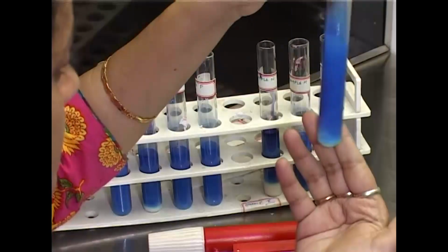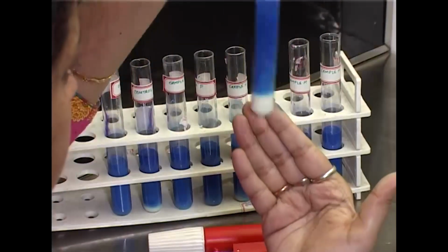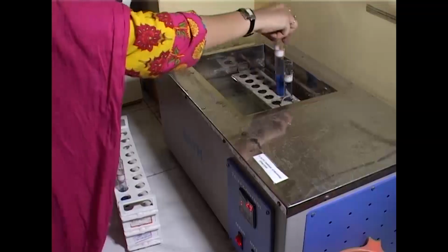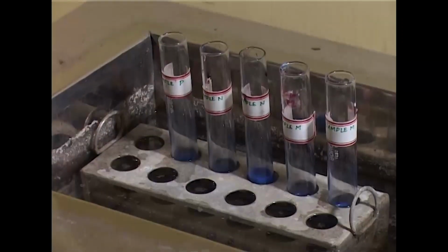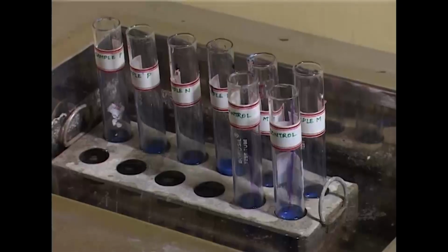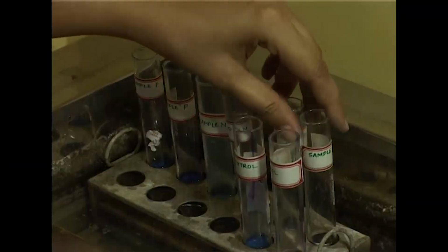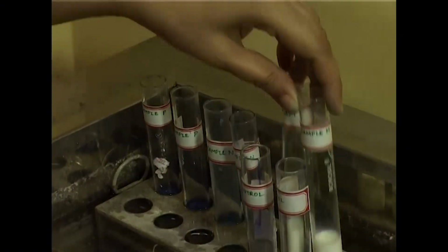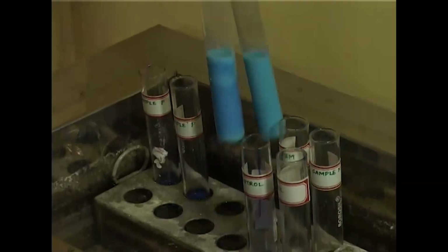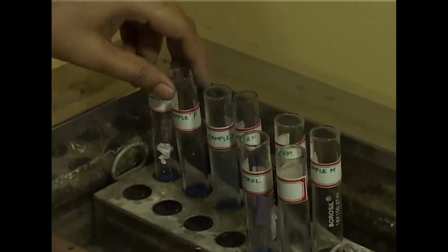We insert the stoppers and then mix the milk samples properly with the methylene blue. We keep this reaction mixture at 37 degrees centigrade and record the speed of disappearance of methylene blue after every 30 minutes interval till a specified period of 6 to 8 hours. Thus, in this way, we can test whether the milk sample is able to decolorize the methylene blue.